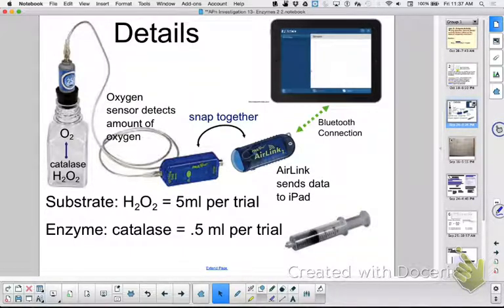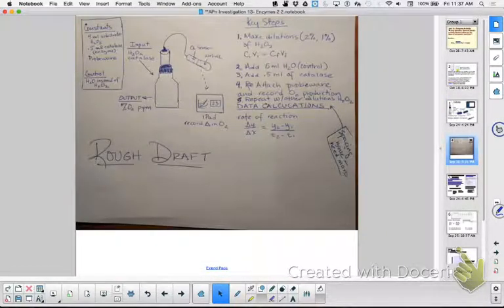Okay? Now, before I switch over to that, I want to just say I made a lab map for you. It was definitely a rough draft of a lab map, and you have a copy of that right in the lab map that I gave you. Okay? So I put a flow chart. It definitely doesn't have enough room in here how I did it, but I would recommend that you make a rough draft so when you put it in there, it's spaced neatly.